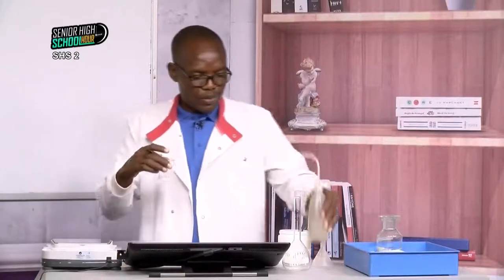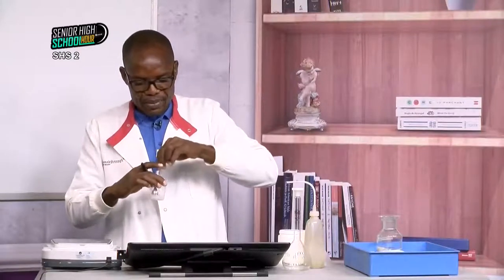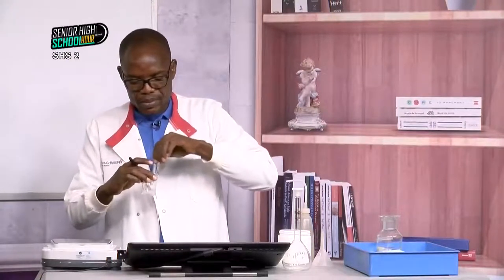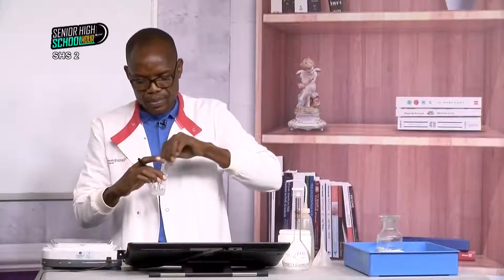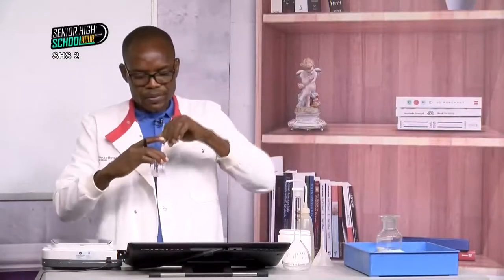Now I'll add a little distilled water to dissolve, using my spatula. So stir it to dissolve. Add a little. Is it dissolving? Yes, it is dissolving. Almost.